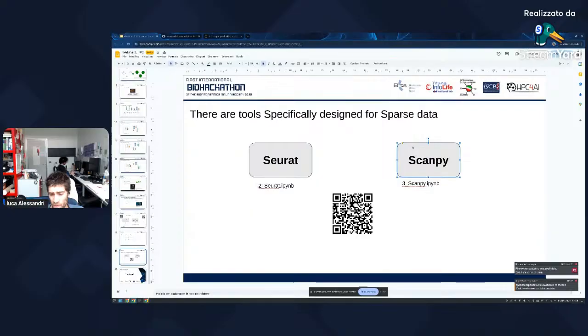There are several clustering algorithms that are really worth a look. One of them is called scVI, a tool that uses autoencoders, so deep learning, in order to project the data from a high dimensional space to a low dimensional space. So just take a look and have fun.